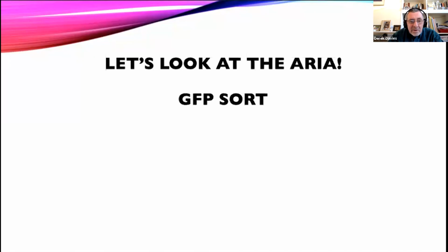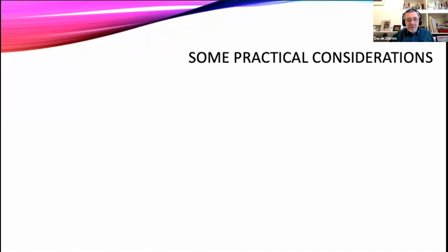Anyway, so what we wanted to do in this bit, while Rui cleans the machine, so remember we always want to check the purity of our sorts after we've run our sort, because that shows that the machine has been doing what we want it to do. So in order to do that, we need to clean the machine. So that's what he's doing at the moment.